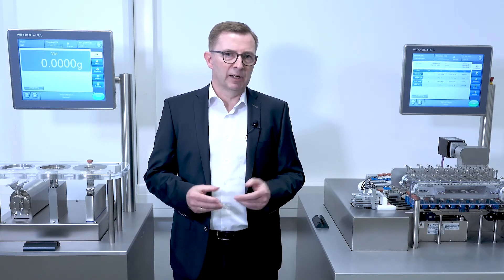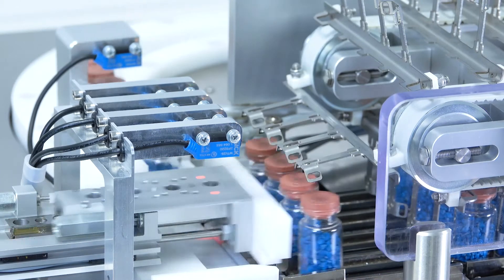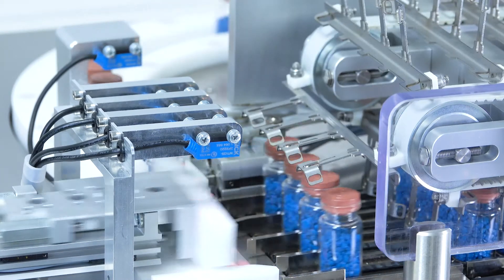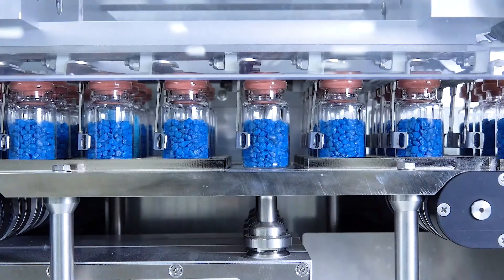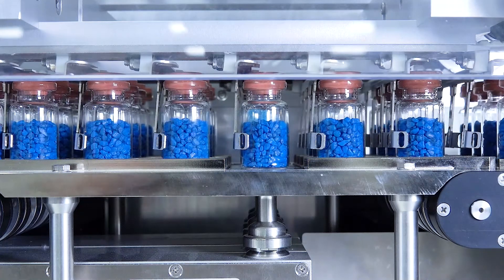However, more typical these days for the handling of bottles or vials is a robot system — a handling system like a walking beam, or what we see here, a pushover system. It doesn't matter which system is used; the number of weigh cells can be added next to each other with a very small track distance to achieve the needed throughput.